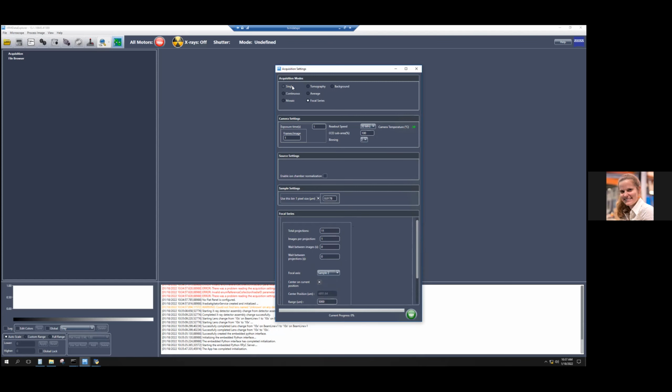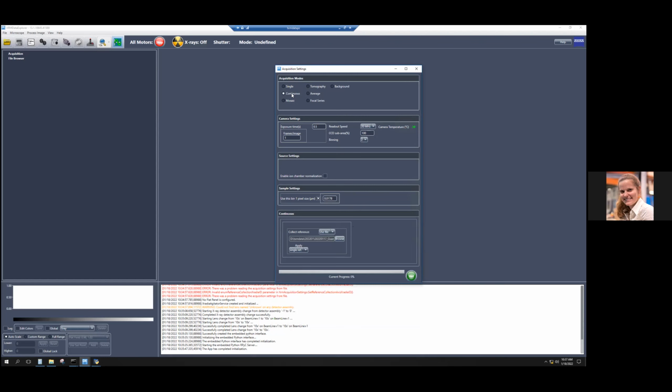So for the continuous mode, we shouldn't use that, for example, with the D-bands, the carbon stuff. It will be a good way to test the radiation sensitivity of the D-band. If we see morphology changes using continuous mode, we know we need to be careful. If we don't see any changes, it's probably not going to be a big deal at all.